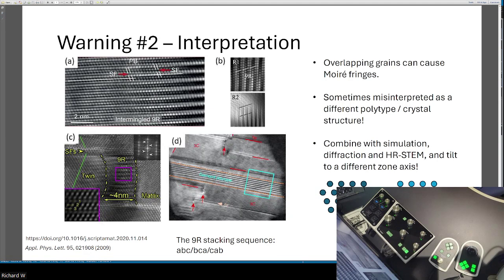But certainly, looking at the sample in different orientations is going to help. It might mean that you need to make 2 samples, one for 100 and one for 110, of slightly different areas. But it's definitely going to help if you've got a challenging sample like that one.